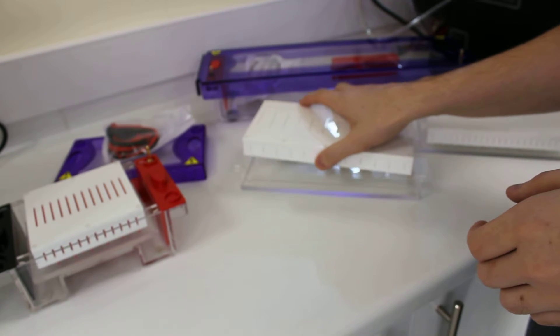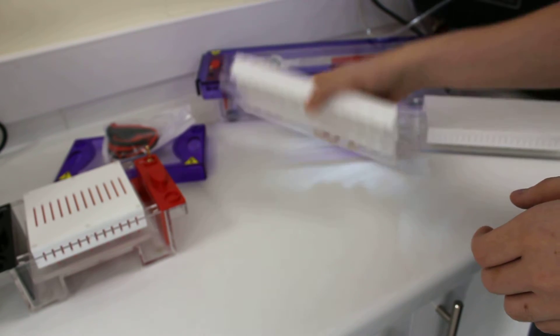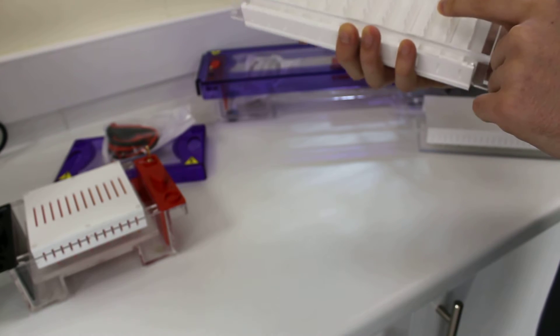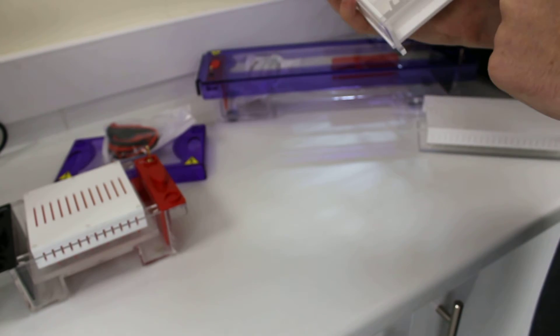And that is cast in the same way, just pour your agarose into there with the casting dams. And you get 96 sample wells, and again you can have one or two marker wells.